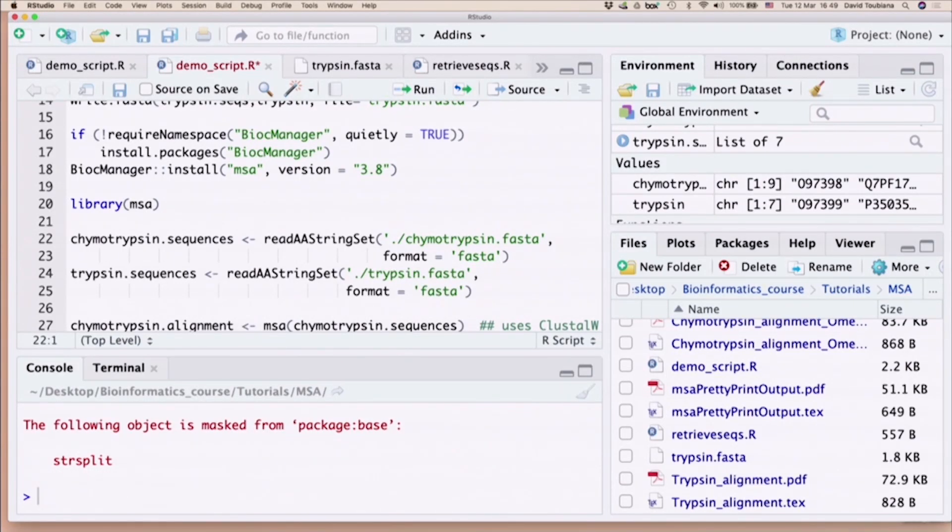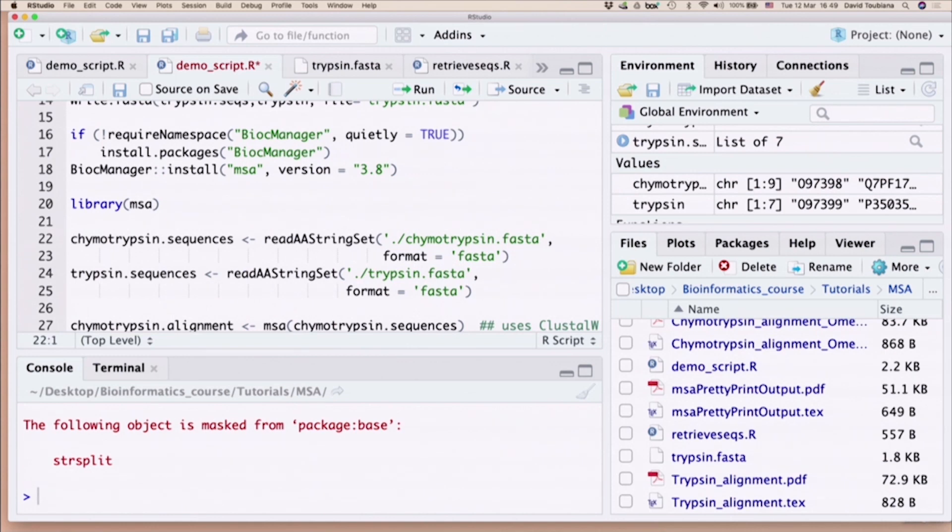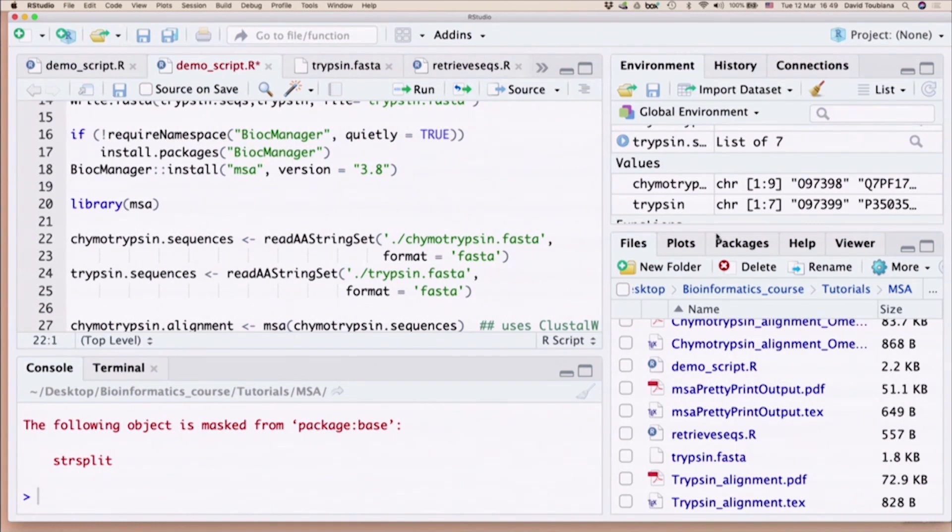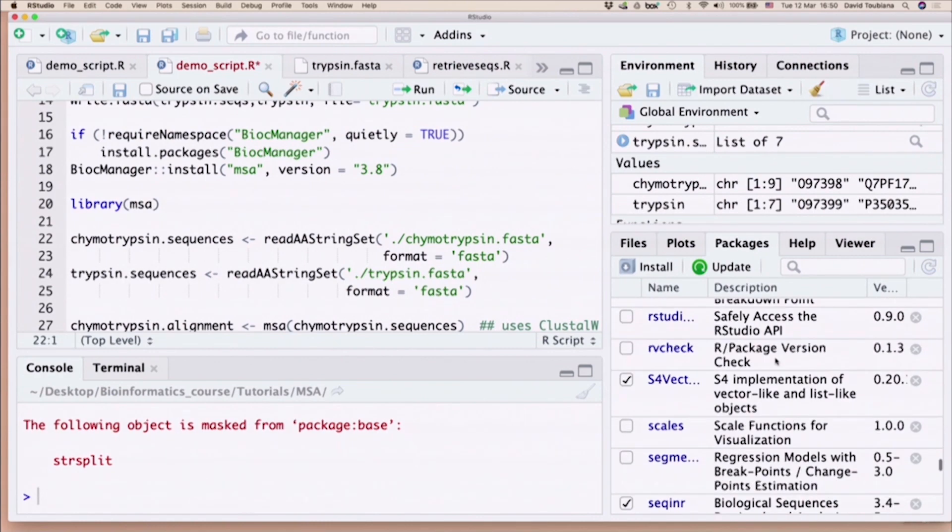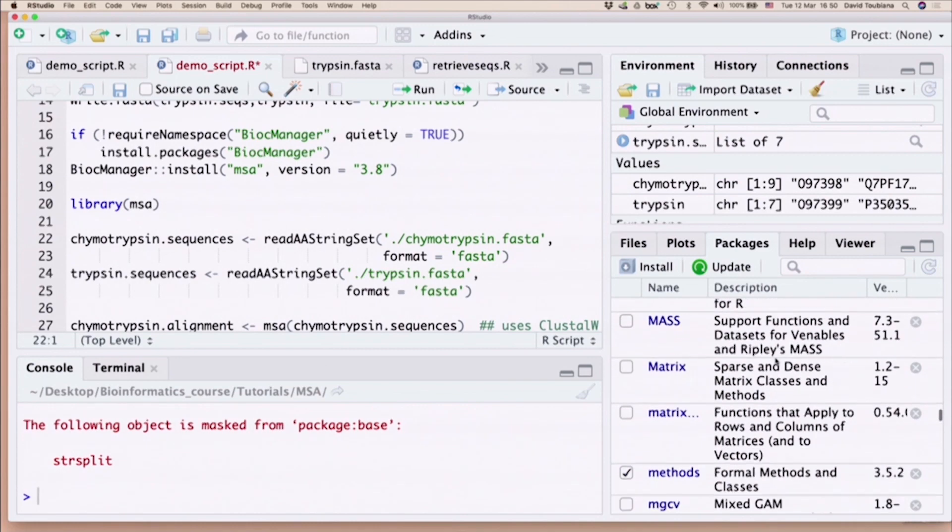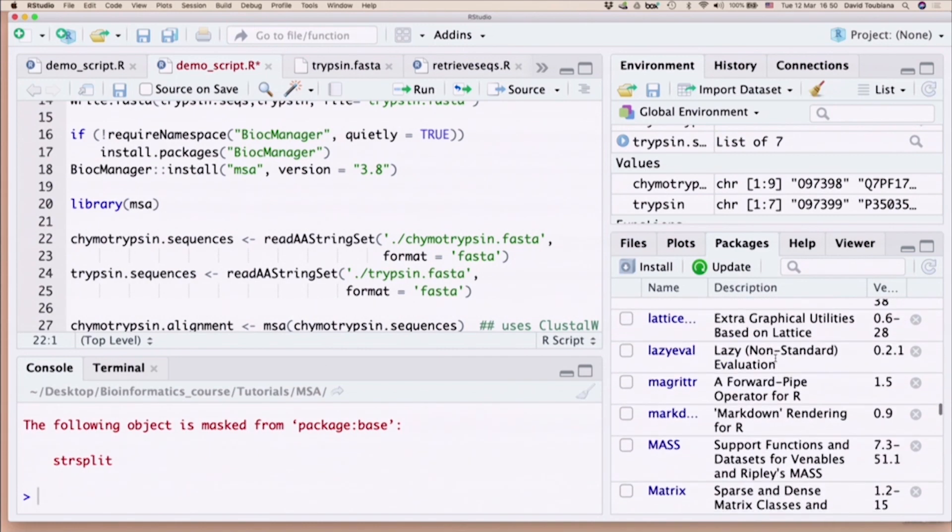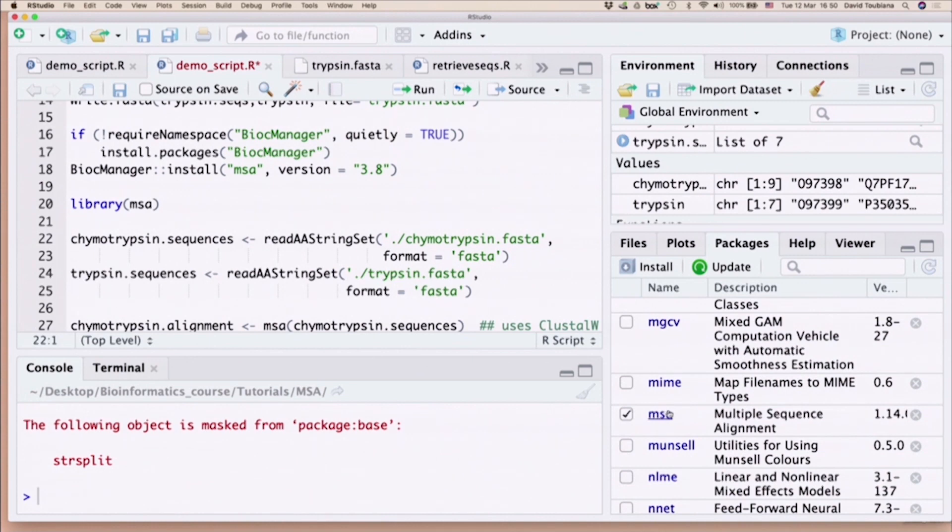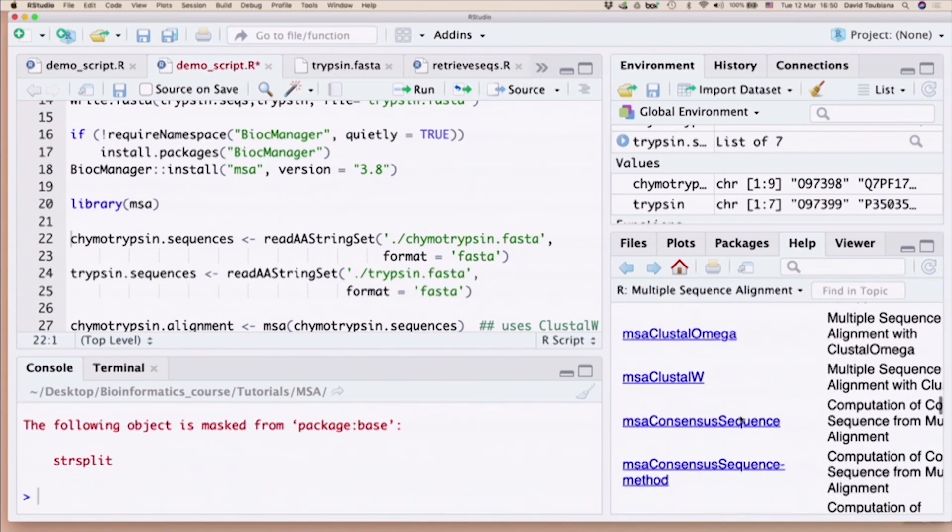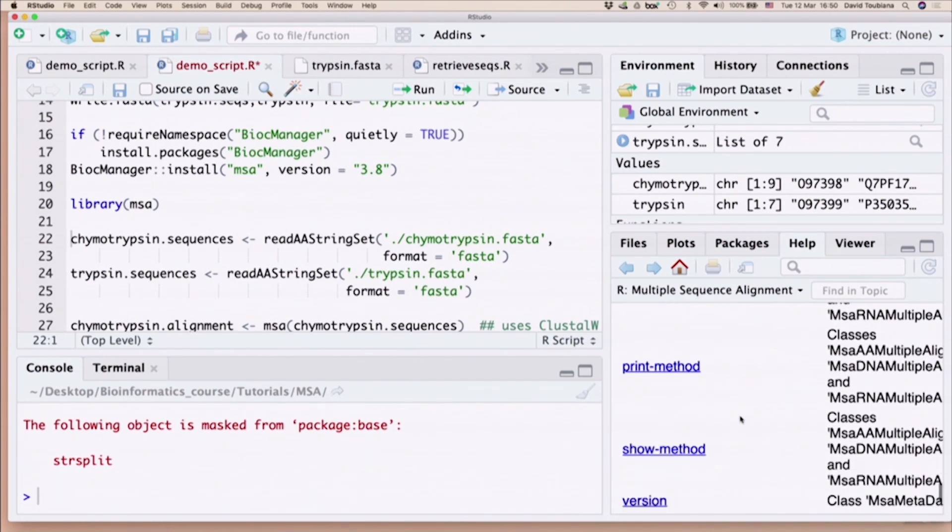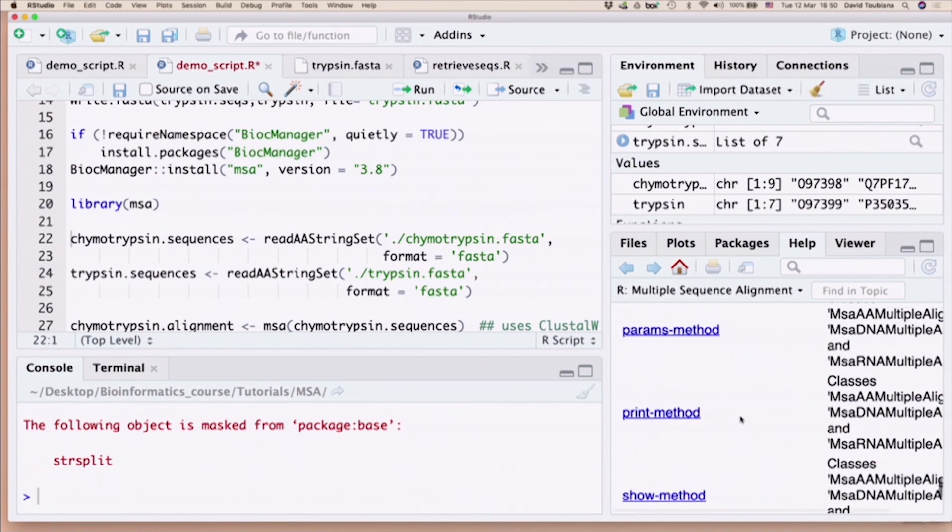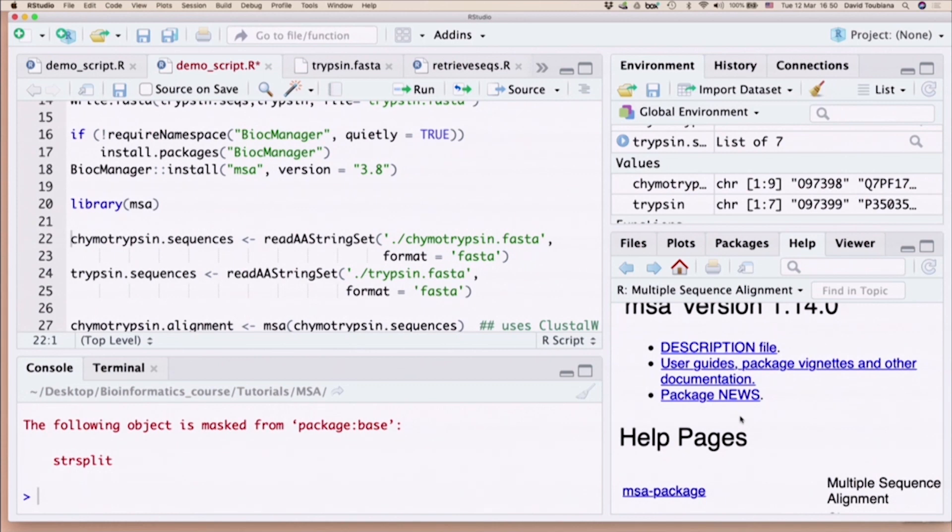Now, we read in the sequences that we stored before as FASTA format with the function readAAStringSet. AA stands for amino acid. You can also read in DNA and you can also read RNA. I encourage you to explore the library msa. If you go here into the right panel and you click on packages, once you install it, it will appear here: msa. If I click on the link here, msa, it will give me all the different functions that I have available in my library.